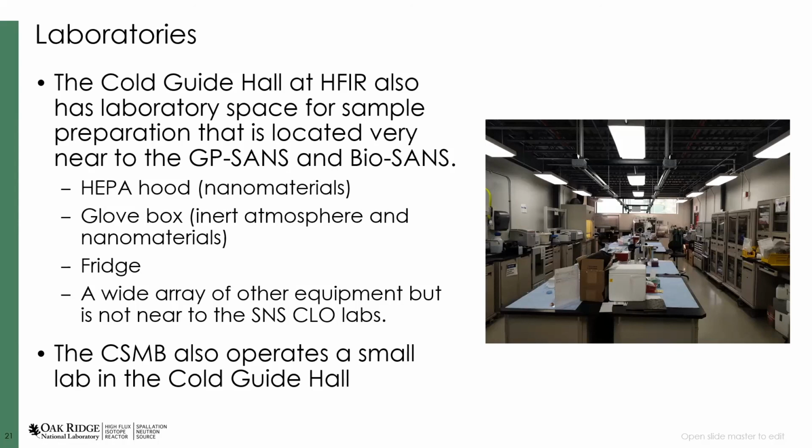And if we don't have the equipment that you need, you can probably find a way to get it to you. We also have some chemicals that are available, so you don't have to drag along everything if you don't want to. The CSMB does have a small lab in the cold guide hall that's right next to the main user laboratory space shown here.